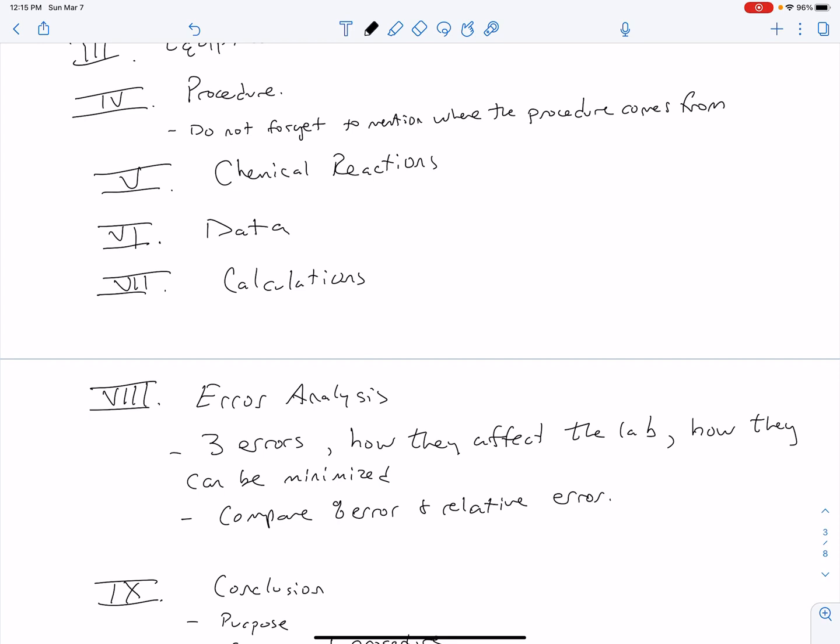Those are all things we consider, because if you got something less than 7.5, that means that you didn't add enough thiosulfate, and there is no possibility of under titration. And you say, yes, there is. No, there isn't. If it changed colors, you either hit the equivalence point or went past, because if you don't reach the equivalence point, the color will not change. It wouldn't have gone from that dark black. Now, if you said it was still the color and it didn't go away, well, then that's a different story.